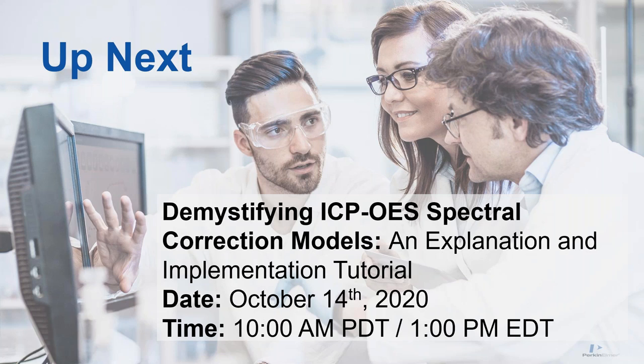Yep, that helps if you're doing this consistent dilution. Sure. And that's what we do with oils, right? Yep, our oil diluent has our internal standard, and all the oils are diluted at the same dilution factor. Therefore, the internal standard is the same in all the oil samples.